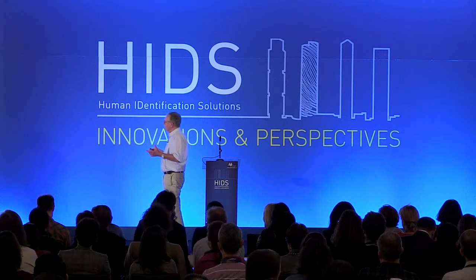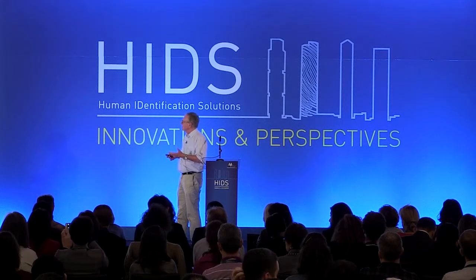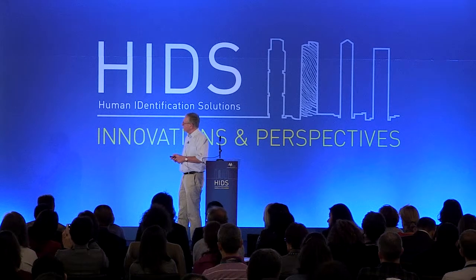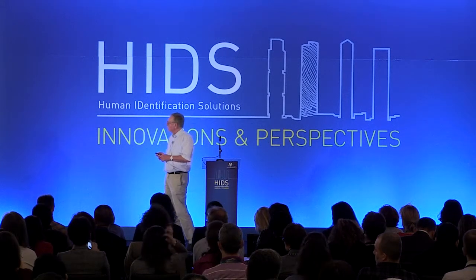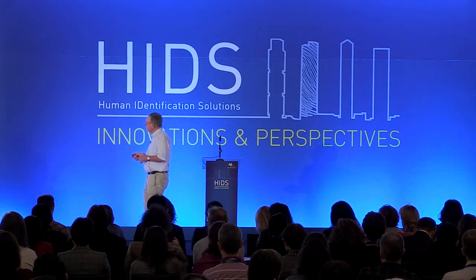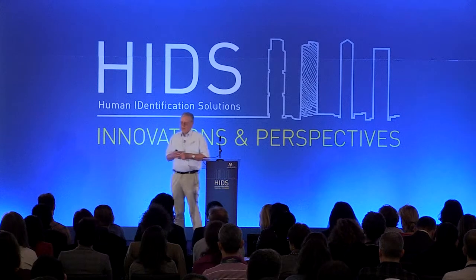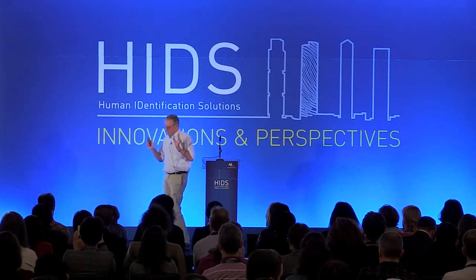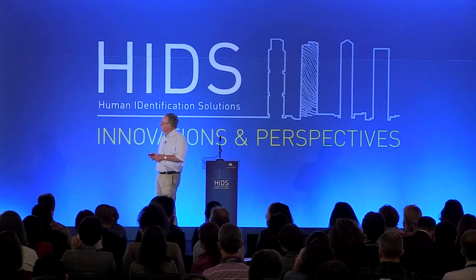And everything that we're doing for casework is accredited in Copenhagen, so it's rather robust. And we also had the problem of mixtures to take into consideration, and of course it's fun to see 1 to 1,000, because it will not be easy to identify 1 in 1,000 with the present technology. But we wanted to do it.